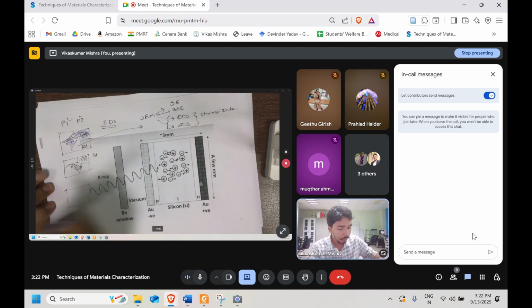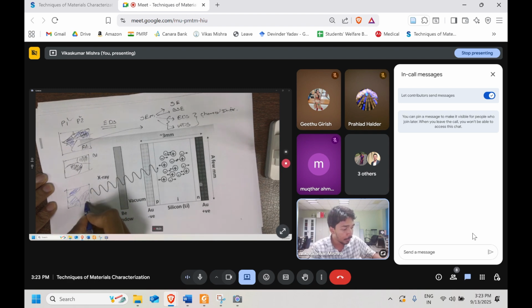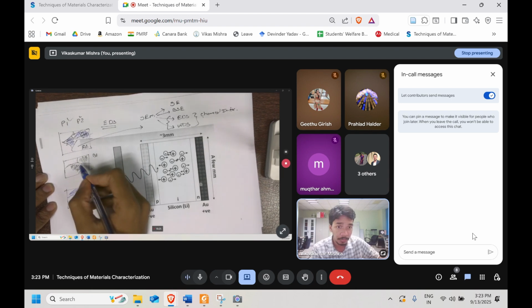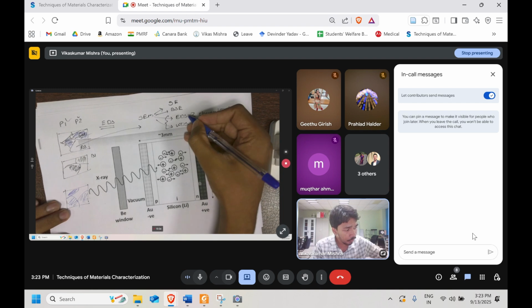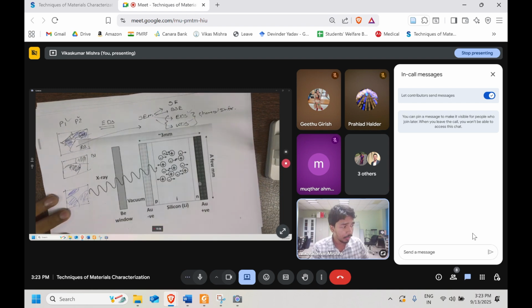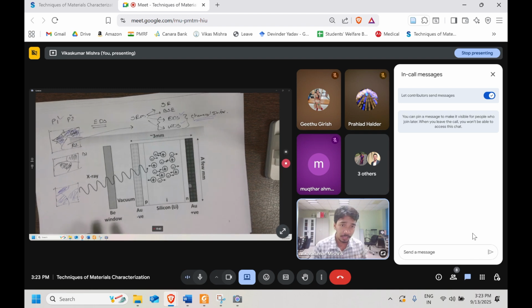And let's say for aluminum, we can assign some red color or blue color. So blue color will be shaded. So you will know that in these particular regions, aluminum is present, or in these particular regions, copper is present. So you can get the spatial distributions, their morphology, how they are distributed. Okay. So that's why this chemical information which we are getting from EDS and WDS is very important. Okay. Now how things are detected.